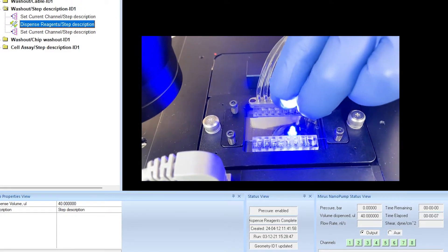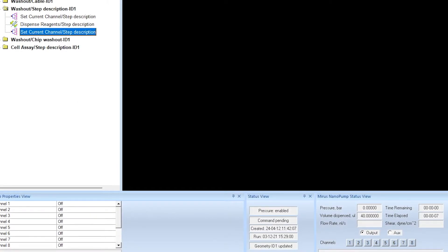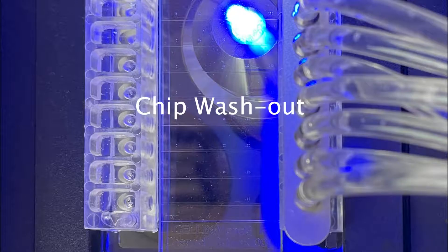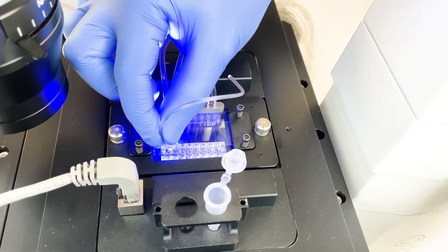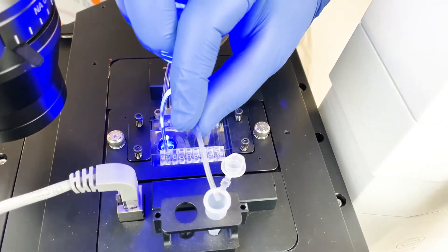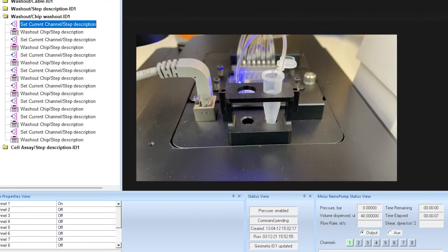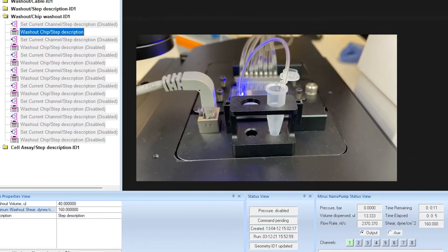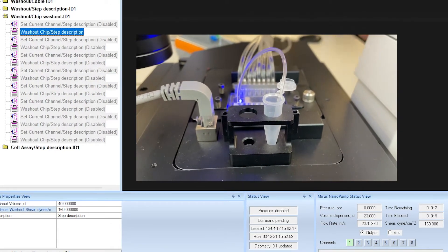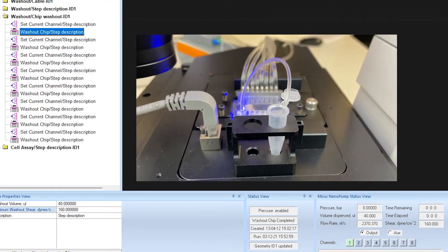The 8-way cable can now be plugged into the input port. Once done, close all the channels of the Multiflow 8. Next, we wash out the channels of the chip to ensure removal of any unbound protein. For thrombosis experiments using whole blood, wash each channel of the biochip as you intend to use it to prevent evaporation issues. Place a waste Eppendorf tube in the holder and connect the output of the chip to the Eppendorf. Click Wash out, chip wash out. This folder has an on-off command to open or close each individual channel and a command to dispense 40 microliters of reagent through each channel. Run these commands for the first channel — you will see liquid coming through the output tubing into the Eppendorf. You are now ready to start the thrombosis assay.